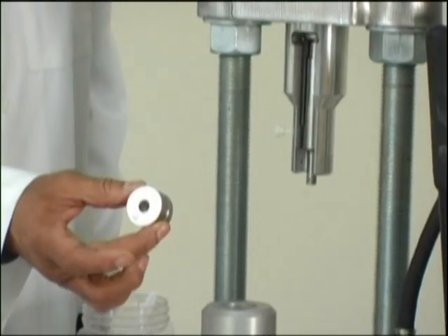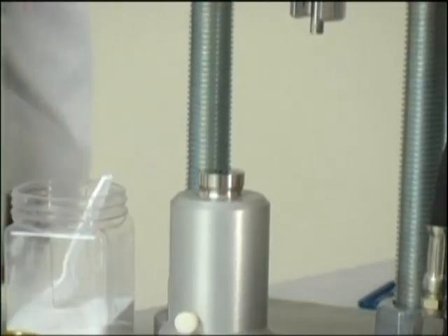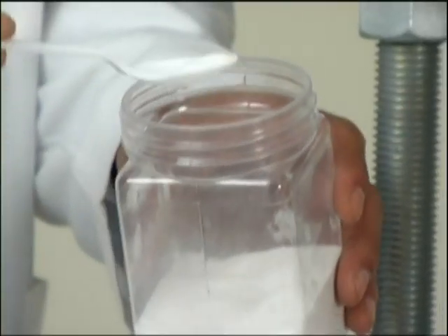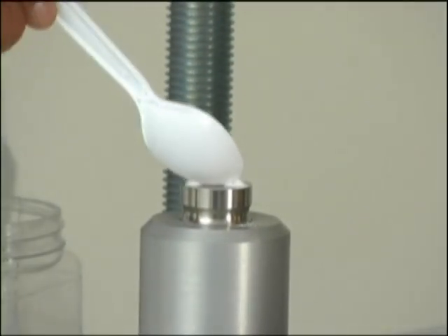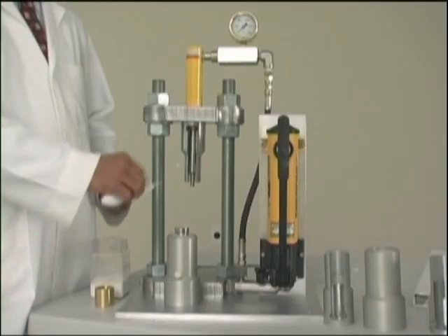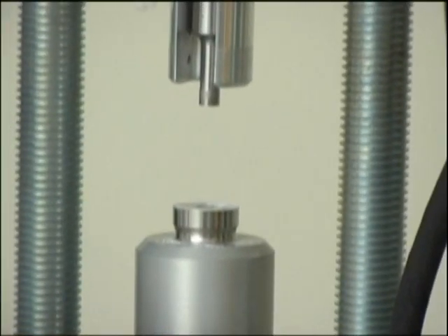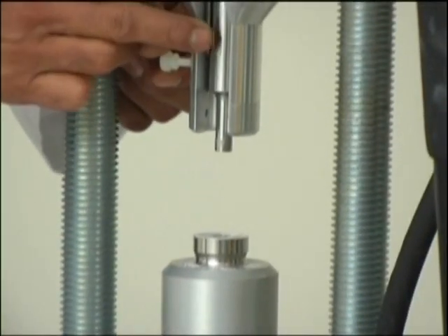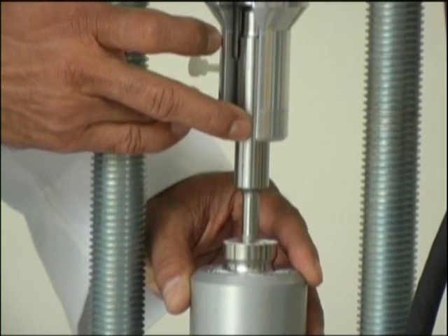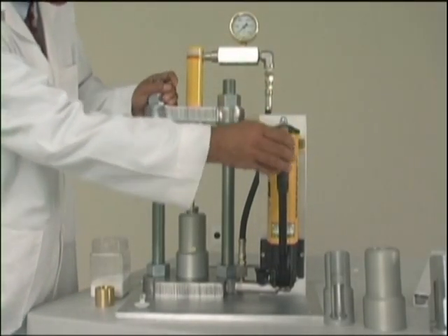Now you put the die in the seat provided on top of the lower punch holder. This is some microcrystalline cellulose powder — I just put it in the die and fill it, then scrape off the excess powder. Then you bring the holder with the die beneath the upper punch. You can drop the upper punch by loosening the screw and pressing the punch with one of your fingers, letting it go into the die.